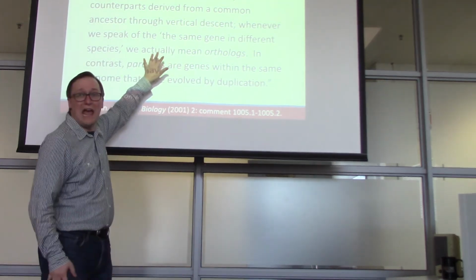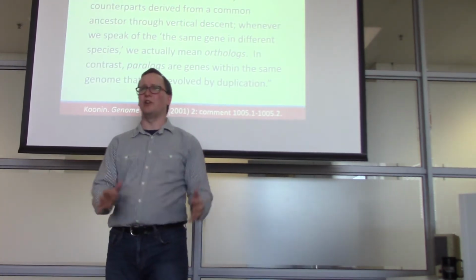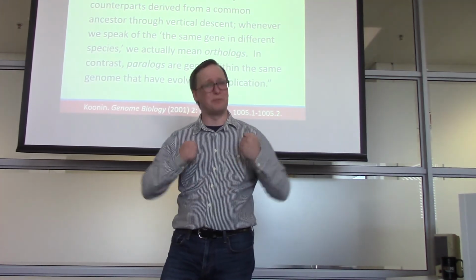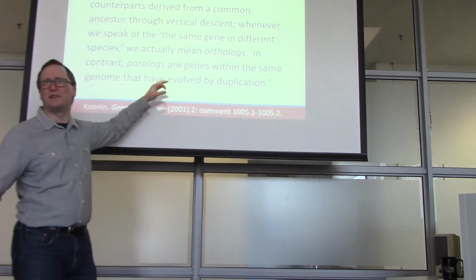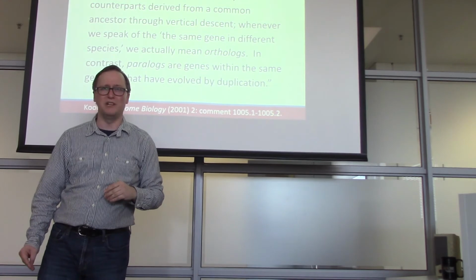All right, so how do we get to proteins? Biologists doing proteomics in general don't care about peptides. What they care about is your protein list. So how do we get to that? First off, why is this even difficult? Why would it be that peptides are shared among different proteins?